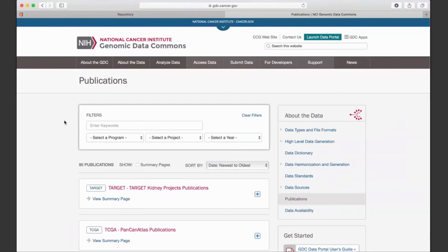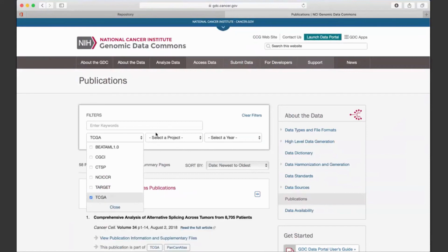We have a question on how can you comment on using HG19 versus HG38? Yes. So I definitely suggest you use HG38, and it's not only because the coverage of the genome is higher, but also it's more accurate. It contains a lot of sequence previously that could not be located, or previously had heterogeneous bases on those locations.